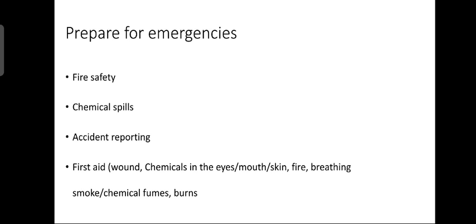Okay. Now next let us see chemical spills on the skin. For a small area, flush the skin with water first. For a small acid or base spill on the skin, neutralize an acid with a dilute solution of baking soda. Neutralize the base with boric acid. For a large amount of chemical spilled on the body, use the safety shower.